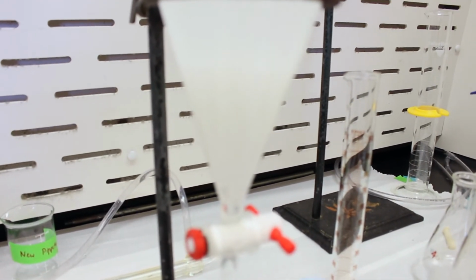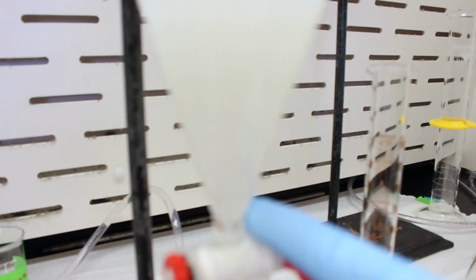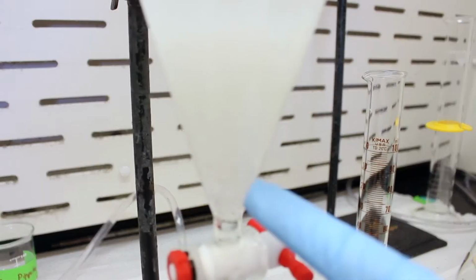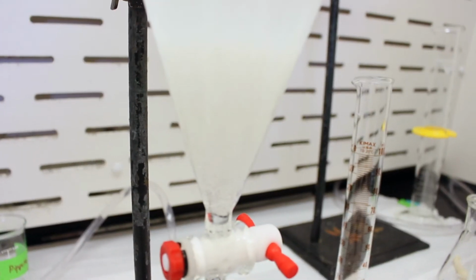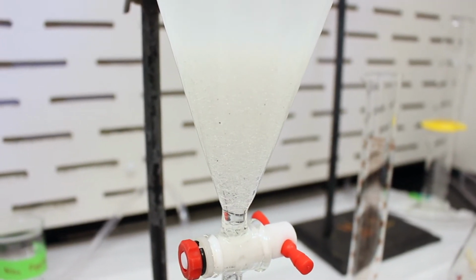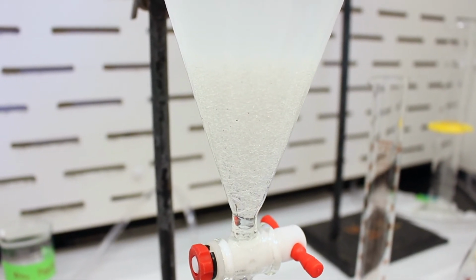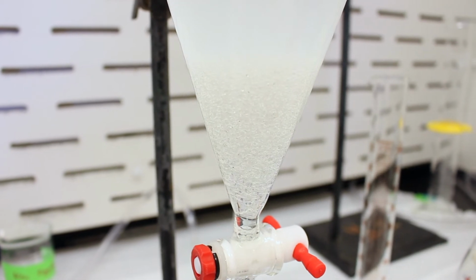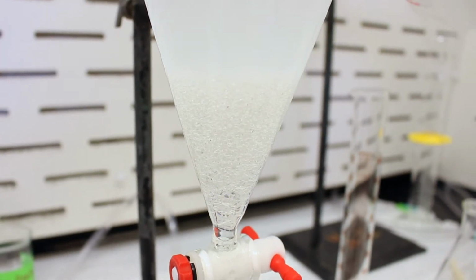And slowly you can see the bubbles resolving, so I think this time it'll look a little bit better. Yep, you can see. So if we give it a few minutes, perhaps the layers will resolve perfectly this time. It's taking a little longer than I'd like. Let's add a little more brine here.